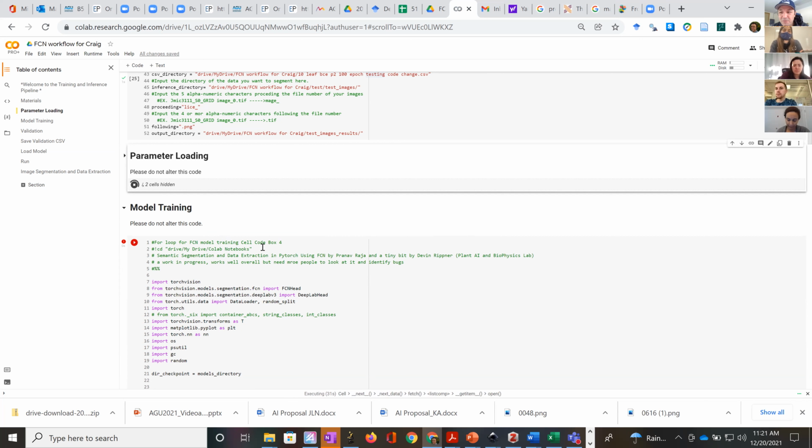And I know my lingo is probably just mind-numbing. So if you have any questions, don't hesitate to ask. So this part of the code takes a little bit to run. But it's just thinking.